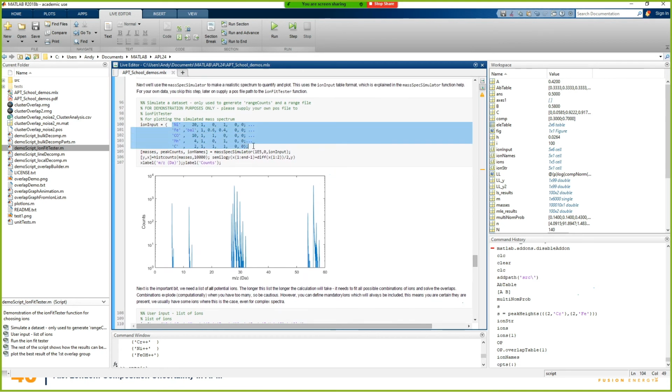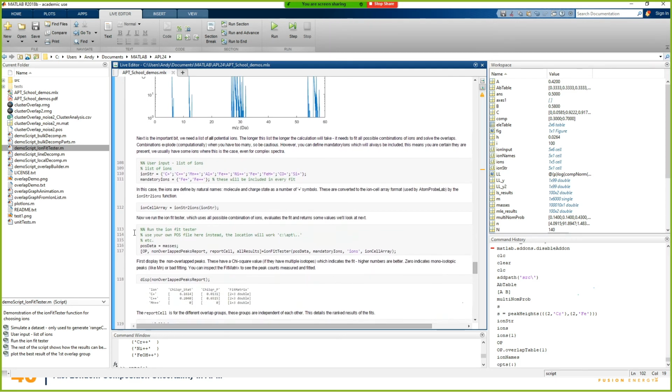Reading this is kind of cheating because this is the answer. Okay, so you would be presented with this mass spectrum in your experiment. You wouldn't know what the true composition is. So here, for example, I'm including carbon monoxide, but there's no aluminium here. Okay, so we're not including aluminium, but we do have nickel and we do have iron. So then what you would provide is your list of potential ions, and this includes silicon. So maybe you look at your mass spectrum and you say, hey, that ion peak looks a bit tall. Maybe it's got silicon in it. Maybe it's got carbon monoxide in it.